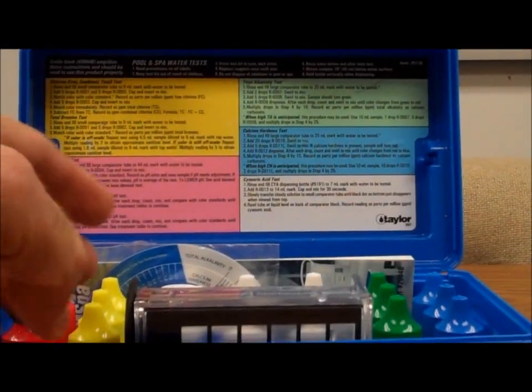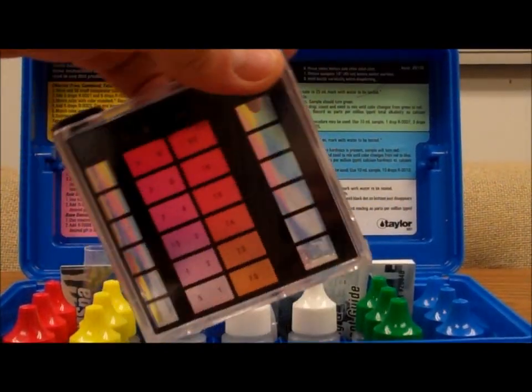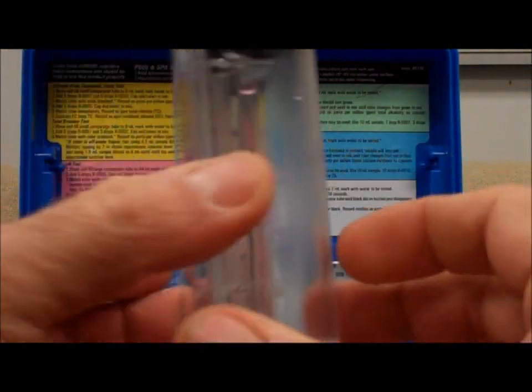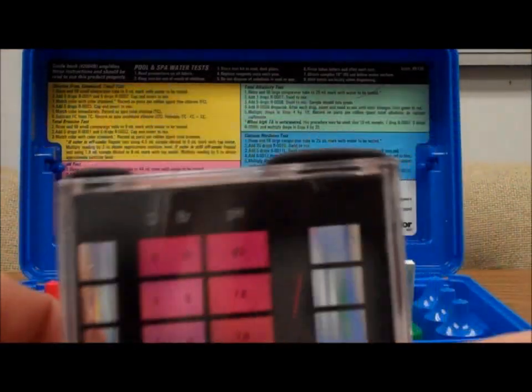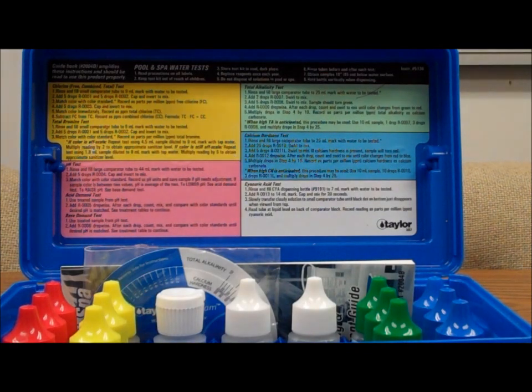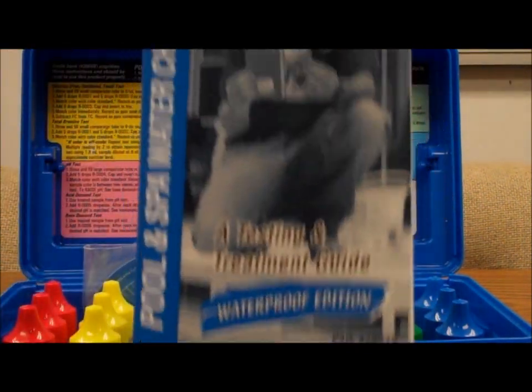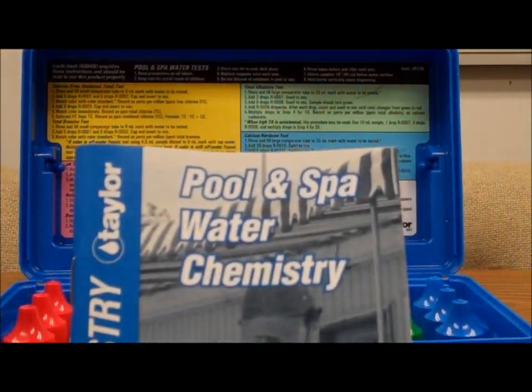We have what's called the comparator — this has two vials that you test your water in. You fill it with water and add the test reagents. We also have a very handy handbook called Pool and Spa Water Chemistry for testing your pool water.